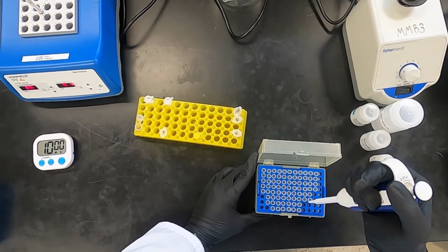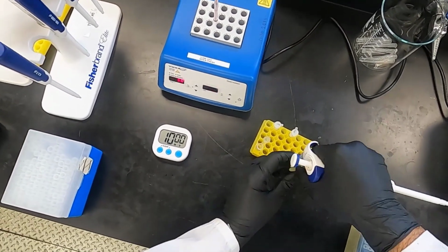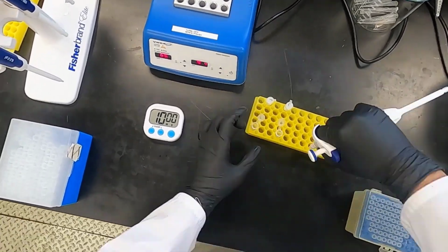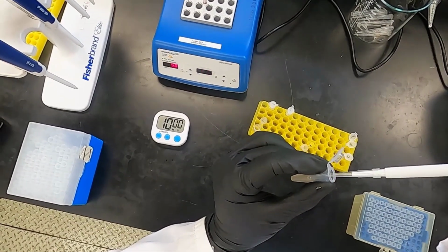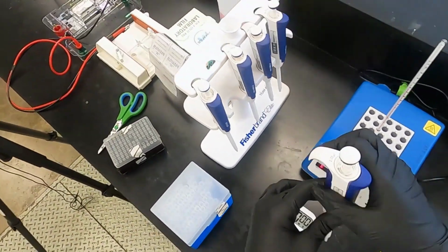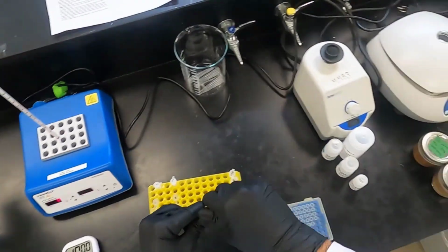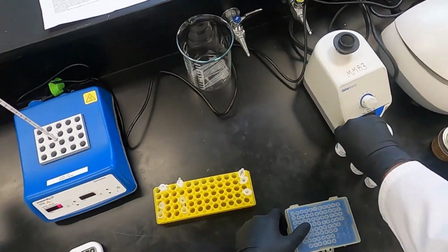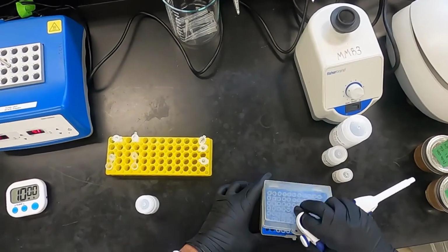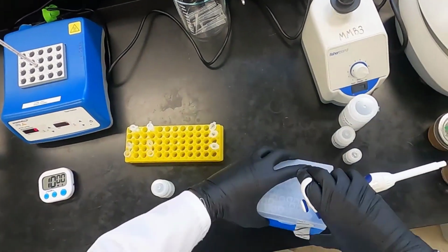Now I'm going to do it for the second one. So I'm going to open this one up. And then you're going to add 220 microliters of solution MS. So we're first going to return proteinase K back on ice. We're going to grab our solution MS, and we're going to add 220 microliters to each. So we're going to grab our pipette tips.